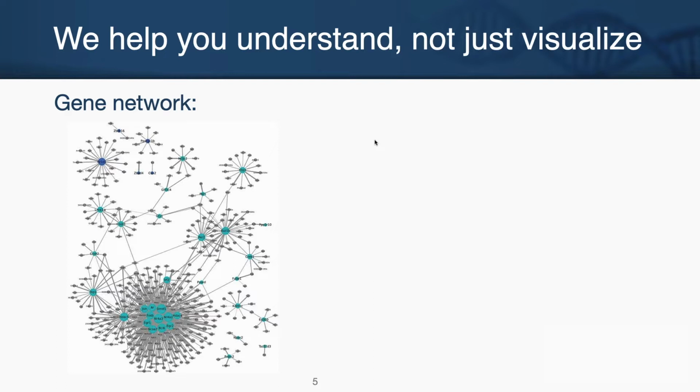can be said here. On the other hand, what if you could produce a figure like this, where you show these are the genes that participate, and here's the mechanism through which they influence this process, a process that was important in my experiment. And the gene that I've highlighted here controls the rate limiting step towards this process. This is a story. It's simple to understand. It's easy to see how the conclusion was made. This figure was created in iPathwayGuide, and today I'm going to show you how to do just that.